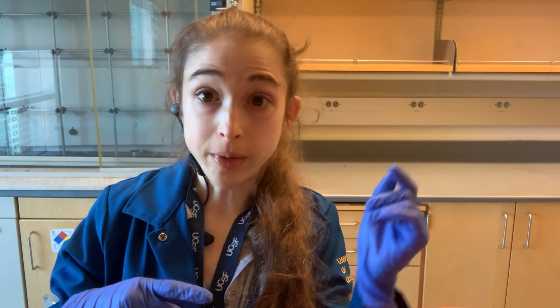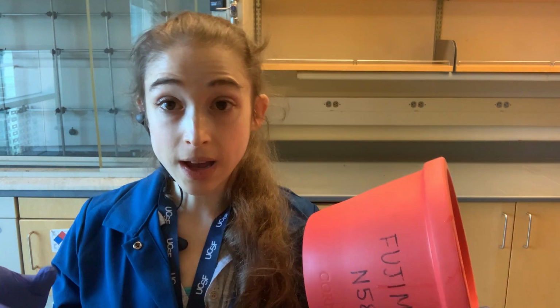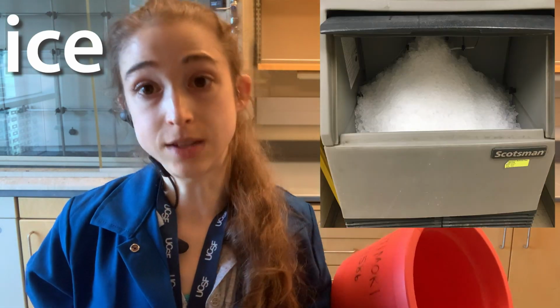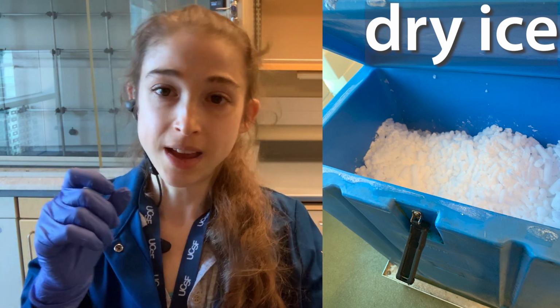Okay, so now we are going to move on to when we want to get things cool. The most common thing: ice. We can have wet ice, so just normal ice, as well as dry ice. That's solid carbon dioxide, and there's more on dry ice in my Halloween related post on how you can do fun stuff with it. But in the lab we can use it because it's going to keep things really, really cold.